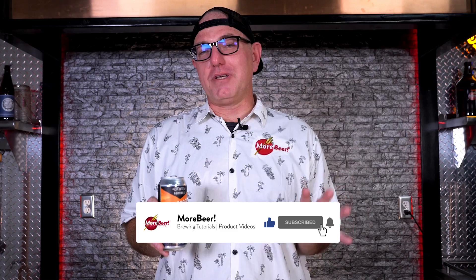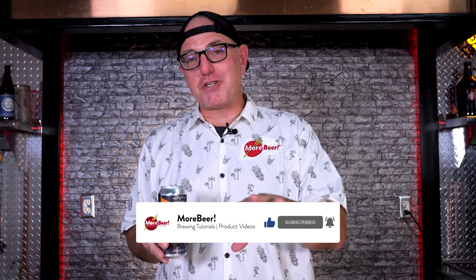I was pretty excited to do this. It's pretty cool to be able to take a measurement without having any previous gravity readings. So I went and got a beer from a friend of mine — the Maria Mia. It's an amber Mexican lager, delicious beer.